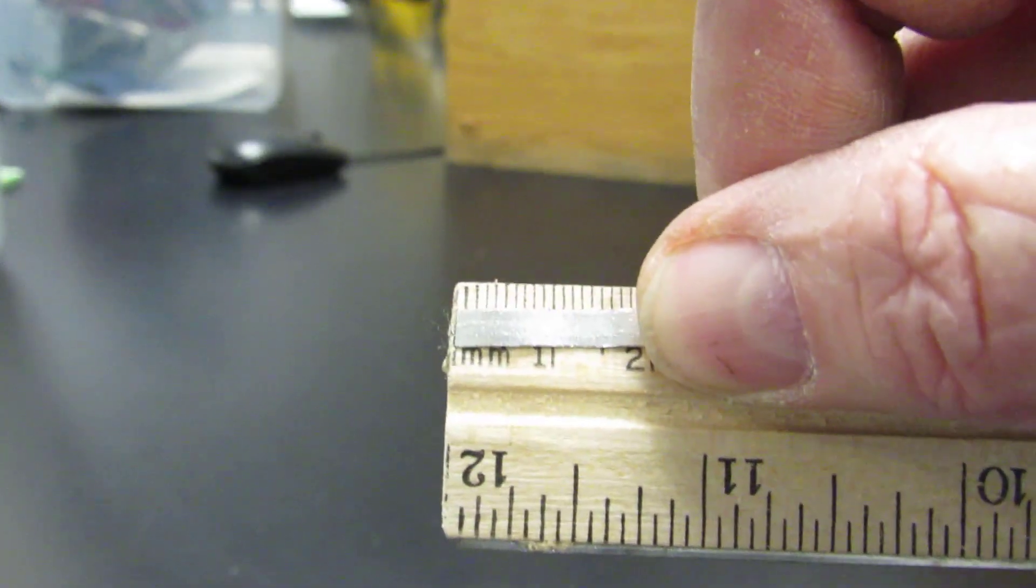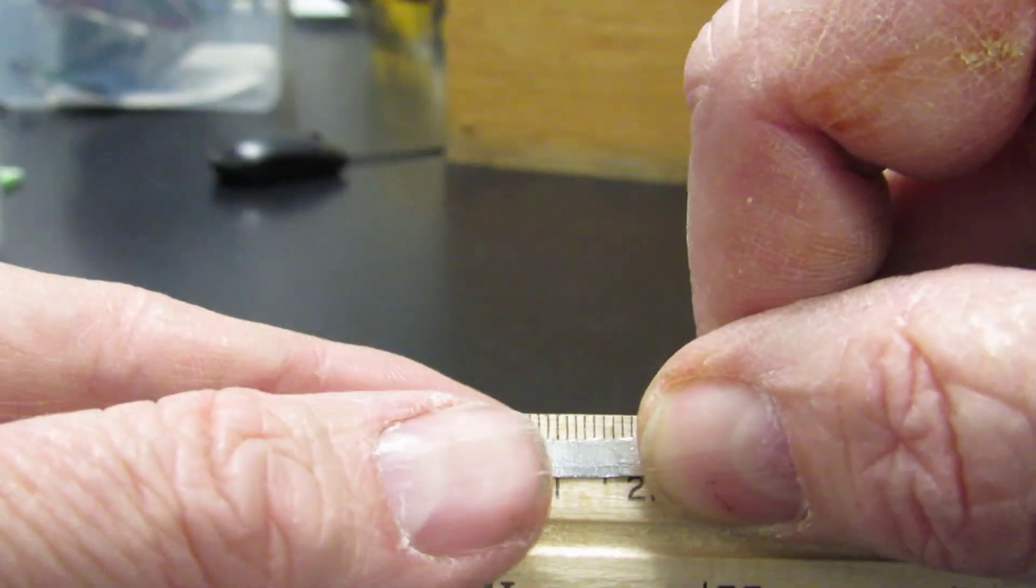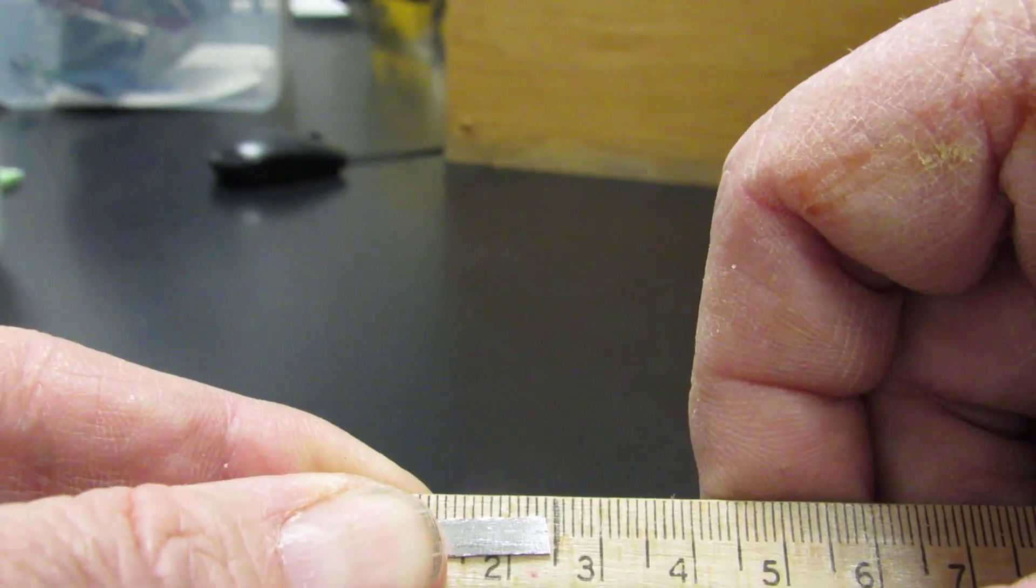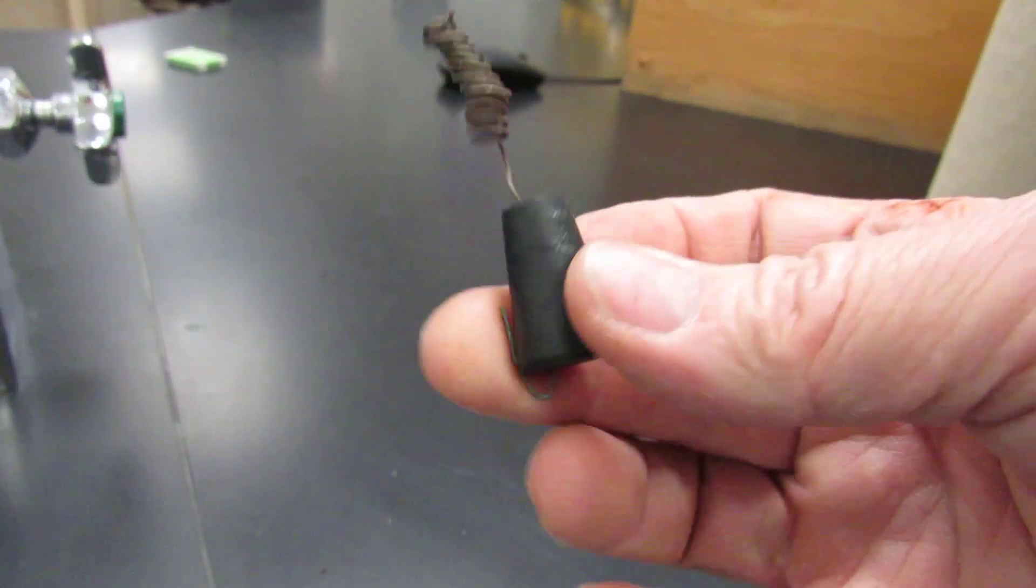Now you need to measure the magnesium. Use your ruler to measure the magnesium and find out how long it is. It looks like that one's about 2.4 something, 2.45 maybe.